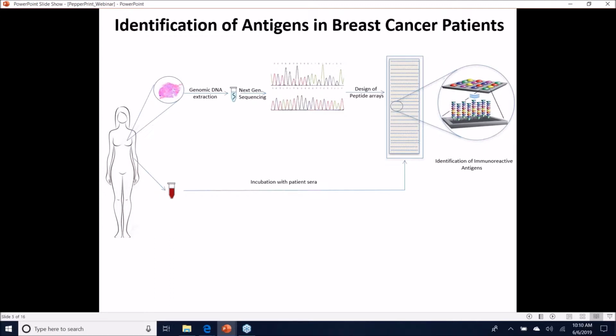So the rest of the peptides would not be displayed. So then the question is, among all the hundreds of thousands of mutant proteins, which ones can actually fit into the HLA peptide binding groove? And if so, can we rapidly screen for those that become key targets for either diagnosis or therapeutic development?